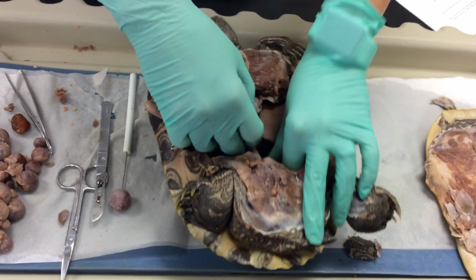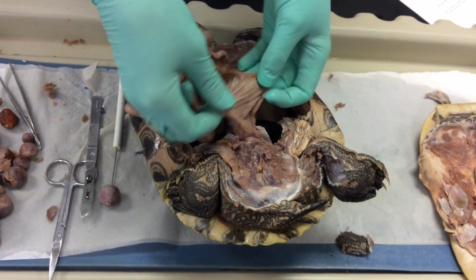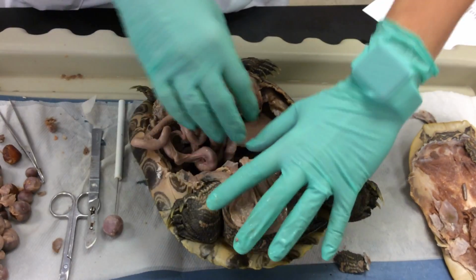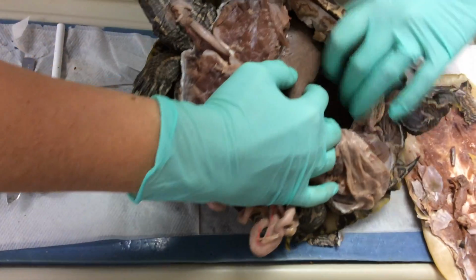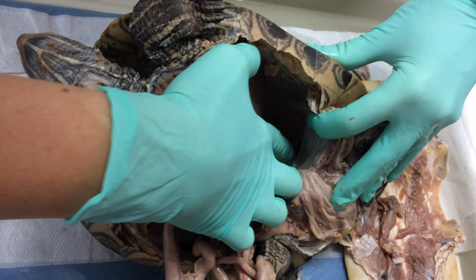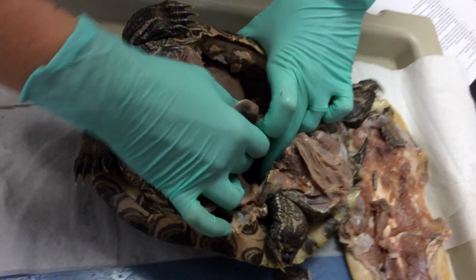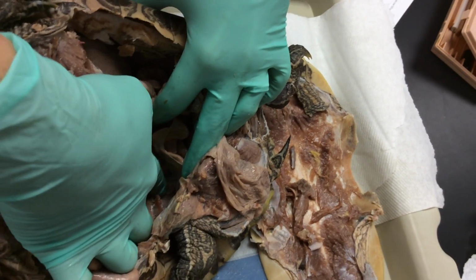Okay. So along with the digestive system, we have the excretory system, and that's this right here. This makes up the urinary bladder, and this is where all the urine or nitrogenous waste is stored, and it too exits the cloaca. This waste is created by kidneys, and these kidneys are located down in here, they're this structure, usually black in color, and we're going to see it on a male. This one is a female. There's one on both sides. There's one here, and there's also kidneys located on this side down here.